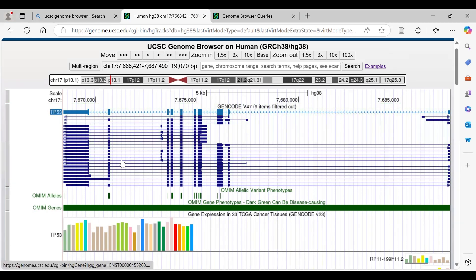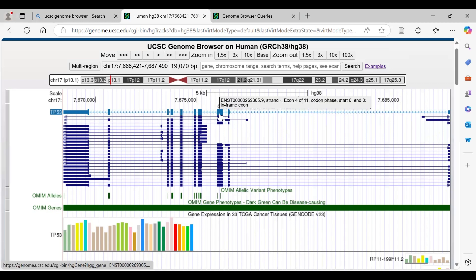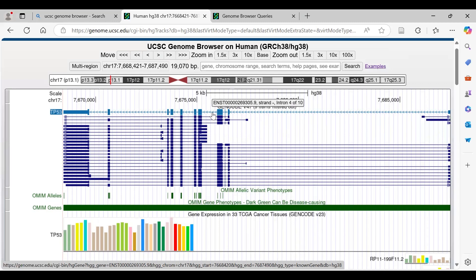To understand the big blocks and thin lines in the visualization: placing the cursor on the big blocks shows they are exons, and placing it in between shows those are introns. So exons and introns are both visualized here.